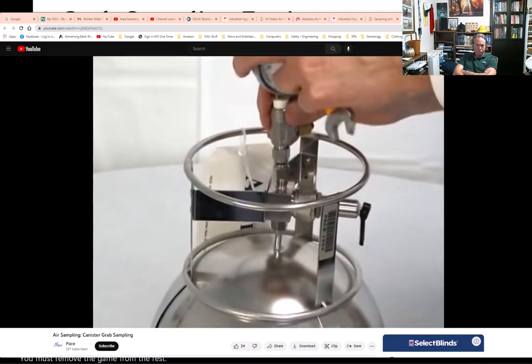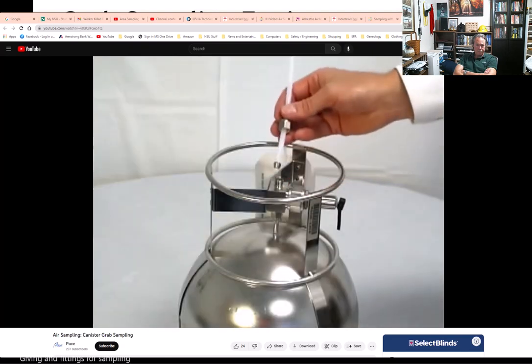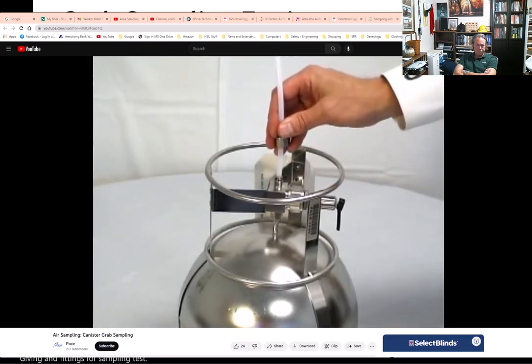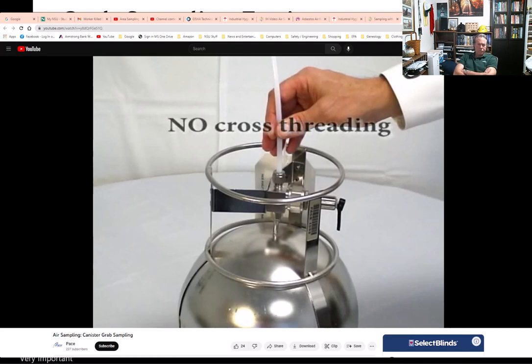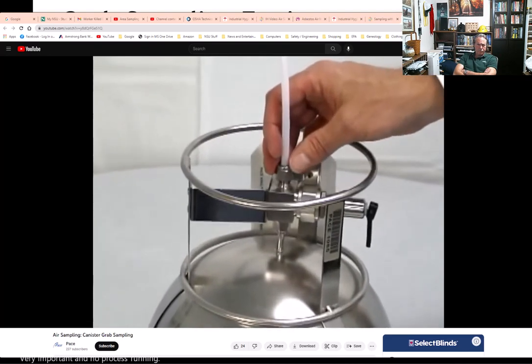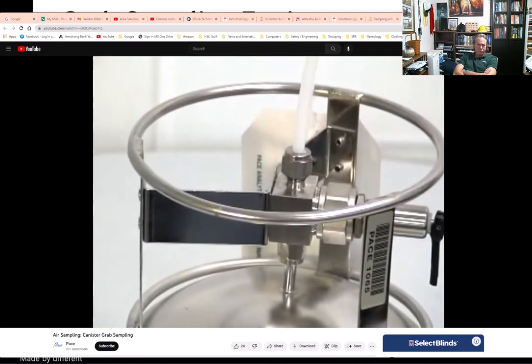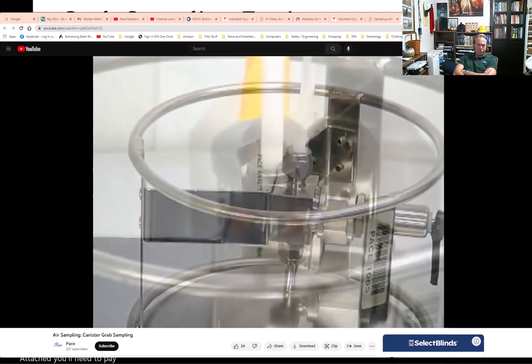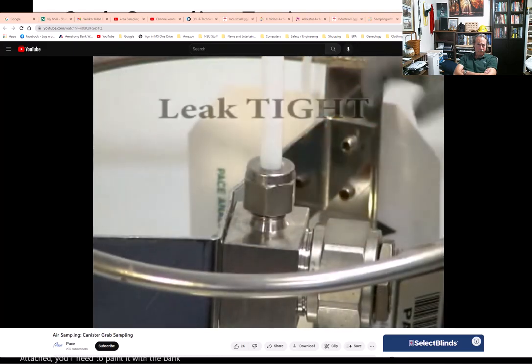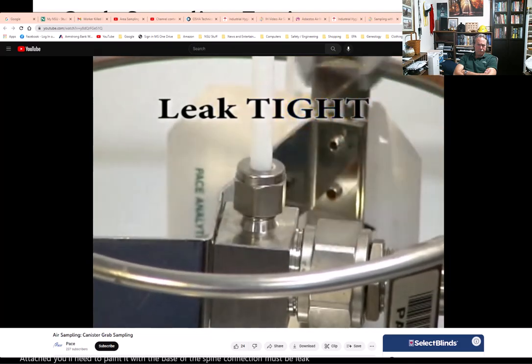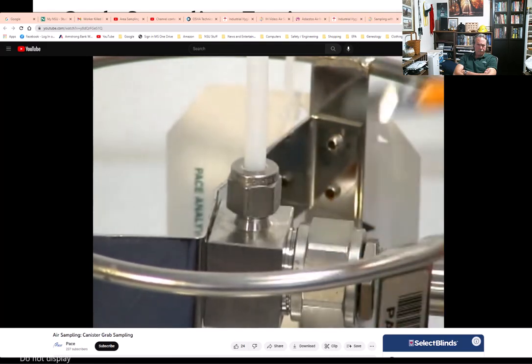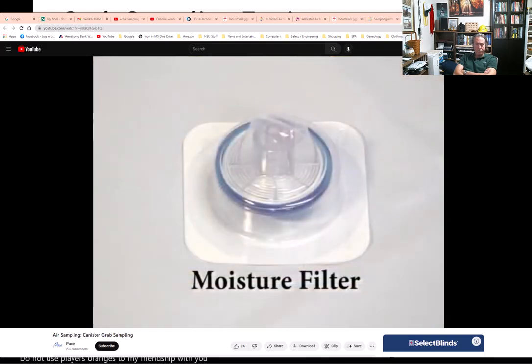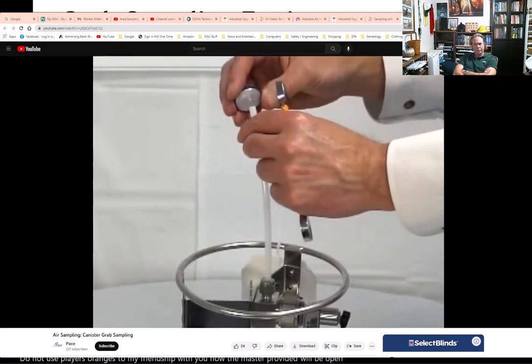After obtaining the reading and ensuring the valve is closed, remove the gauge with the wrench. If required, attach the tubing and fittings at this time. The connection utilizes swage lock threading — it is very important that no cross threading occurs. First finger tighten the swage lock nut, then tighten with the 9/16th inch wrench until the connection is leak tight. Use only the open-ended wrench — do not use pliers or adjustable end wrenches. If provided, the moisture filter will be placed into the free end of the sample tubing.